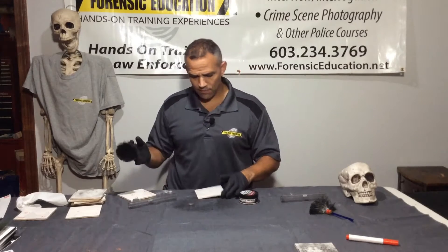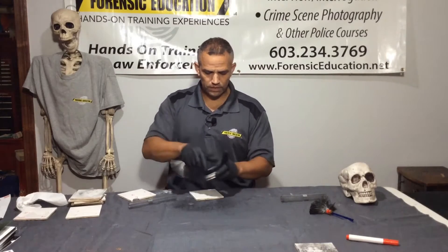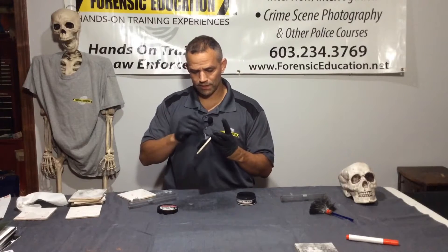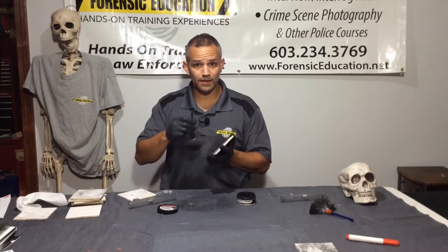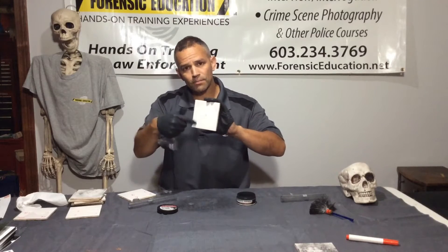Error number three: I have this beautiful print and I'm going to try to over-develop it. You saw how nice it was. I'll use a little bit more powder — I'm going to try to develop it even further. So you keep dusting, you keep dusting, you keep dusting. Now you can see the print is gone. I over-developed it. Once you see all those friction ridges, you're good to go. If you didn't super glue fume it, you can wipe away your print — and that's what happened here. We've just wiped our evidence out.